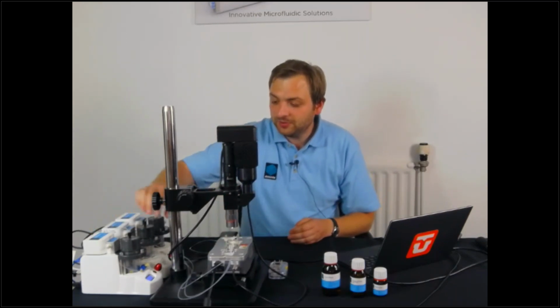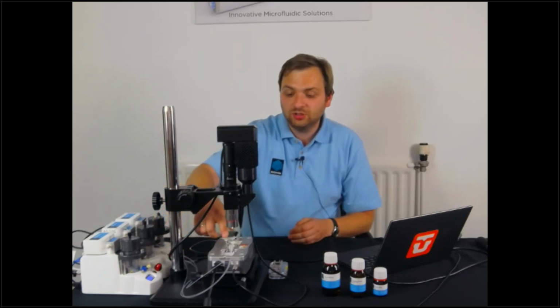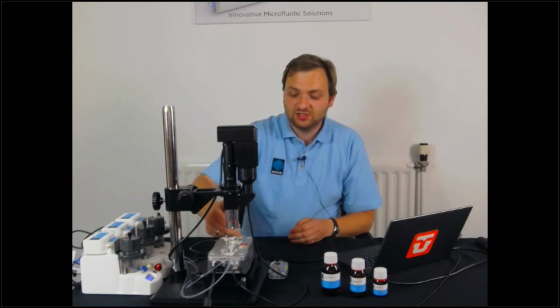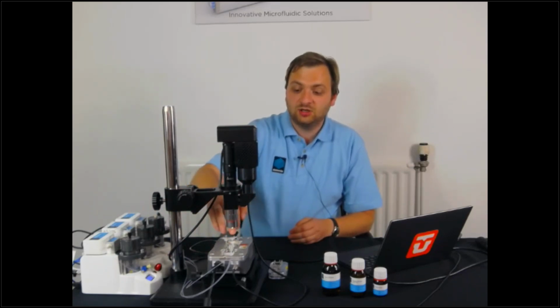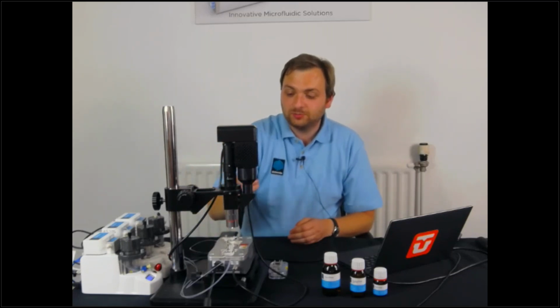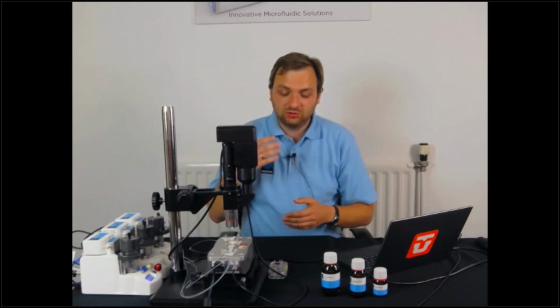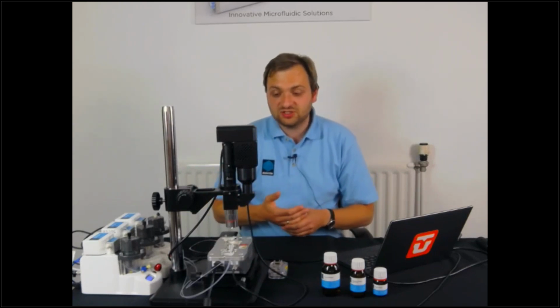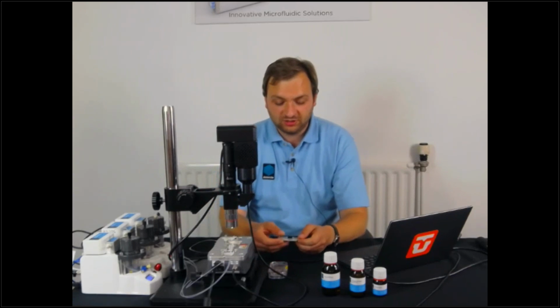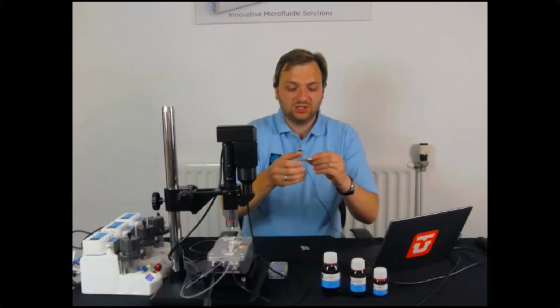So once we've dealt with pumping, the chip is connected using standard HPLC tubing, using a standard interface. The chip is observed directly using a microscope, which observes it by flashing an LED array down the chip and reflected back through the mirror. And then we're simply collecting into a simple laboratory reservoir. But in more complicated systems, that can be done into designated glassware, can be done into a large batch vessel. The chip is mounted using Dolomite interfaces. So these are very easy to do and undo, like that.